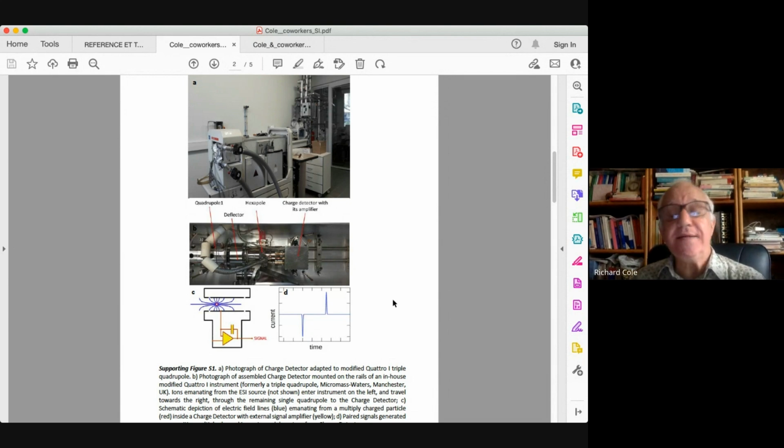All right, so essentially in our experiment, we're going to be measuring two things. We're going to be measuring the magnitude of the charge, which is really proportional to the area of the spike. And the two spikes, of course, should be symmetric. So the area, or sometimes the peak height, is used, and that's going to be proportional to charge. With the calibration, that's going to give us our charge measurement on this single particle.